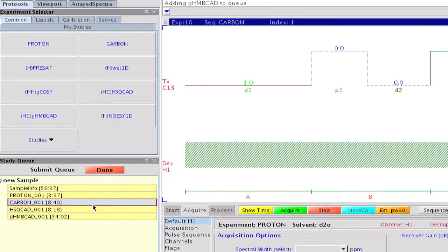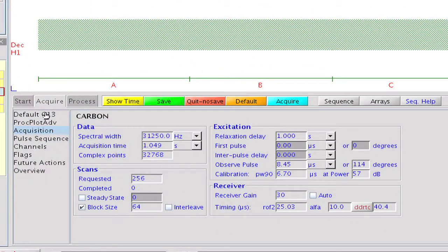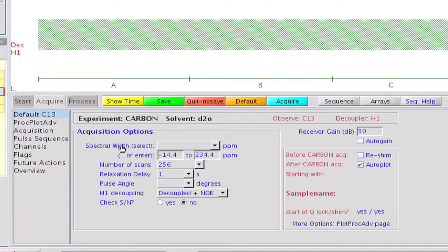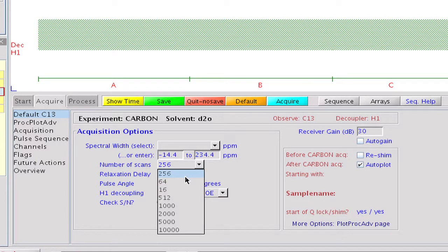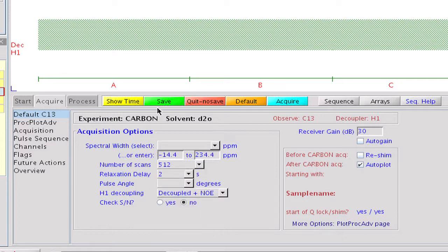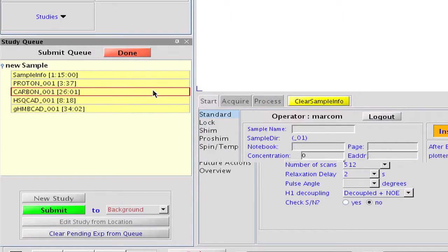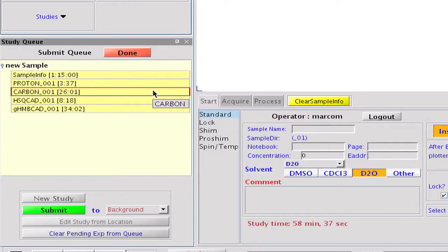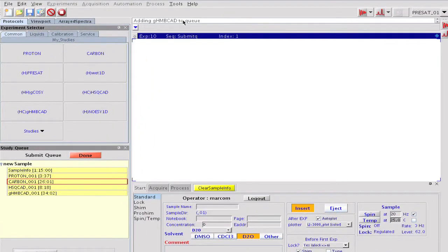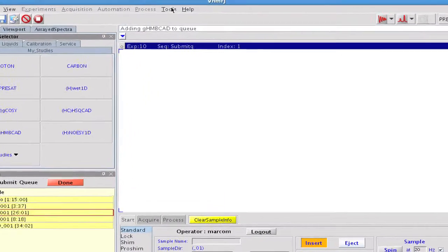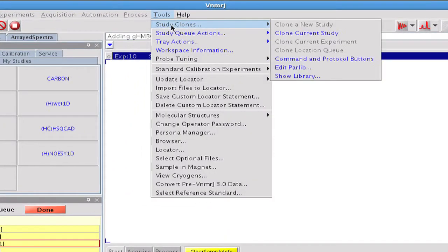So let us just customize our carbon, which takes with the current parameter set 8 minutes and 40 seconds, by doubling the relaxation delay and the number of scans to be acquired. When saving it, the corresponding experiment time is changed to 26 minutes, reflecting the customization that we have just done.